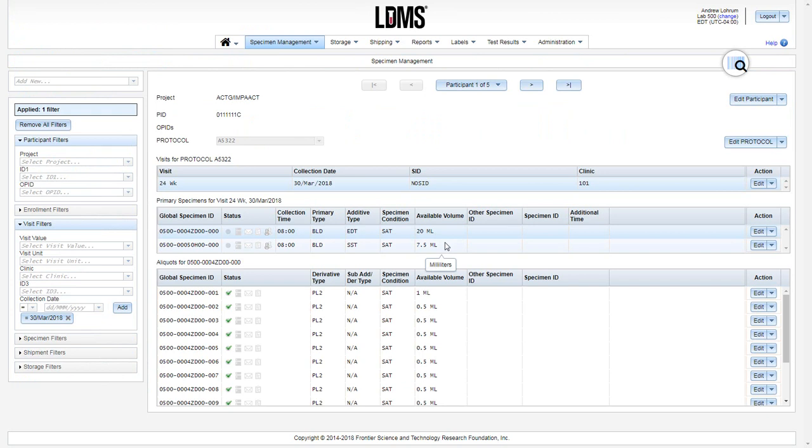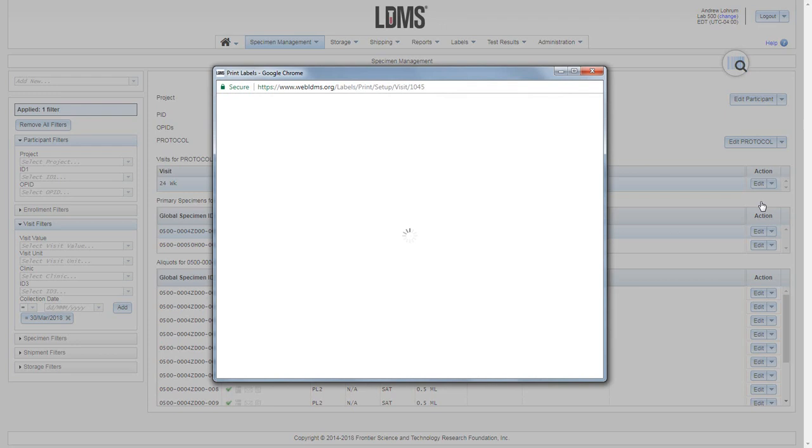After that date filter is in place, generate the labels at the visit level by using the drop-down menu and clicking print labels.